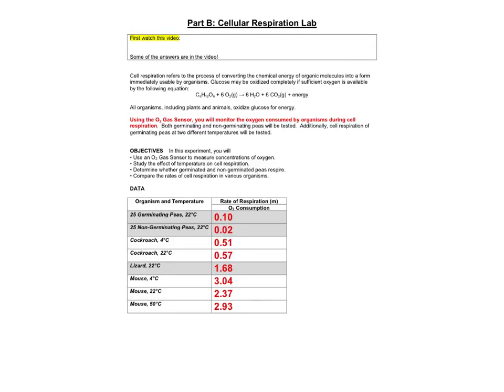This video is about Cellular Respiration Lab Part B. You should have already done Part A. The idea behind Part A is that you were using the movement of a red droplet to measure the amount of oxygen consumed by organisms in different scenarios. This, Part B, is very similar. Again, we will be studying the amount of oxygen consumed.